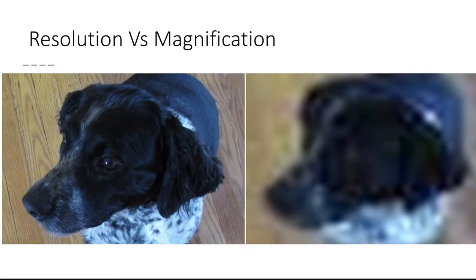Normally, when we introduce the term resolution, there's a lot of confusion about what resolution actually means compared to magnification. We hear resolution very often when we talk about things like our TV screens or smartphone screens, and a high resolution we just associate with being good. The thing about resolution is it describes the clarity of the image. Magnification is simply how enlarged or magnified the image actually is, how zoomed in it might seem. And a lot of the time, magnification and resolution actually do not come hand in hand. The more magnified an image is, typically the resolution goes down.